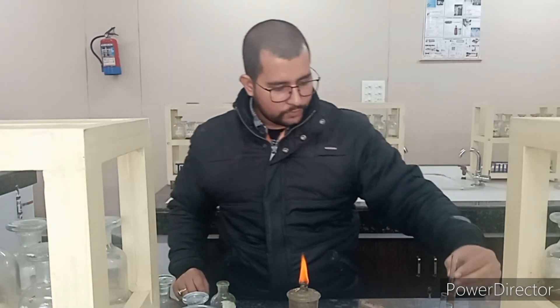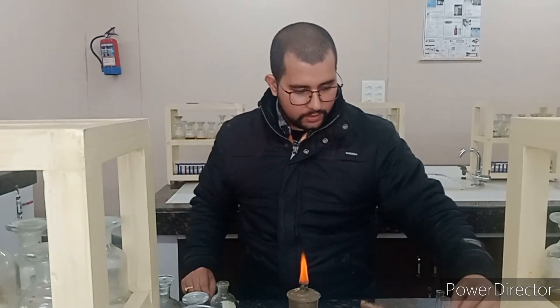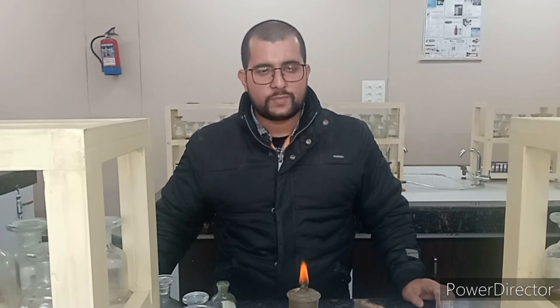So we have concluded that in the given sample, copper is present as the cation and sulphate is present as the anion. So the given sample is copper sulphate. Thank you.